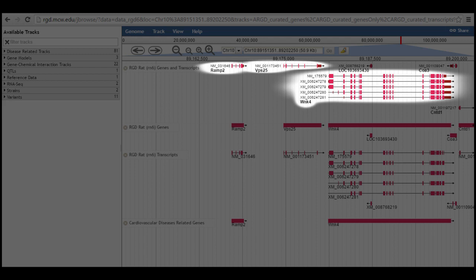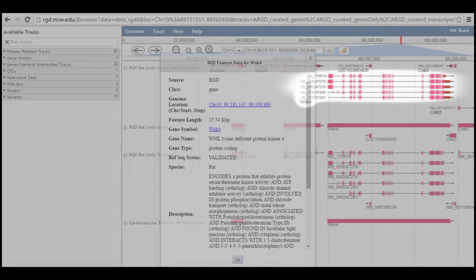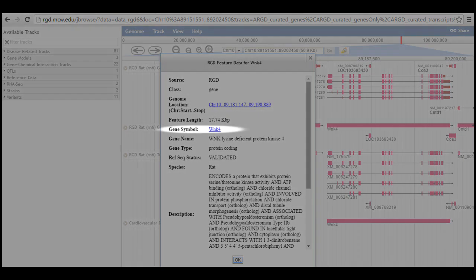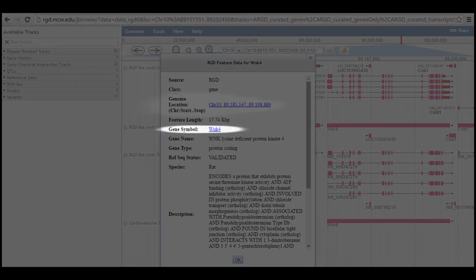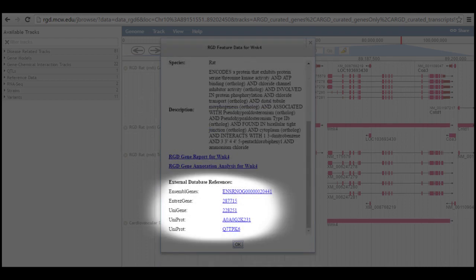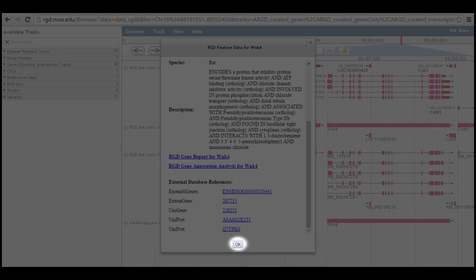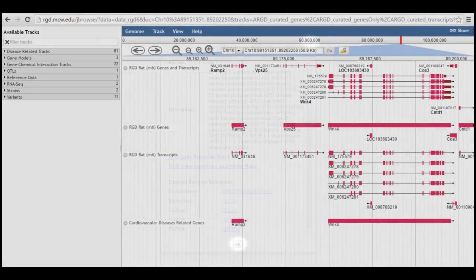Clicking on a gene object, in this case the group of transcripts for WNK4 brings up a pop-up with information about the gene and a variety of links, including links to the RGD gene page, the exact location of the gene in JBrowse, external database records for the gene and its proteins, and the RGD annotation analysis for this gene in the Gene Annotator tool. Click the OK button, or X in the upper right corner of the pop-up, or click anywhere in the browser display to close the pop-up.